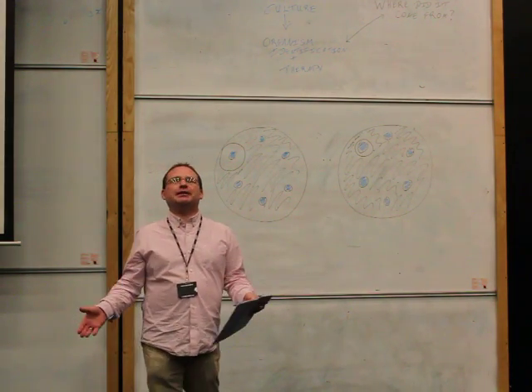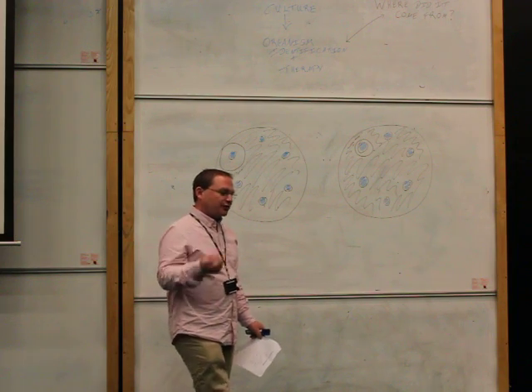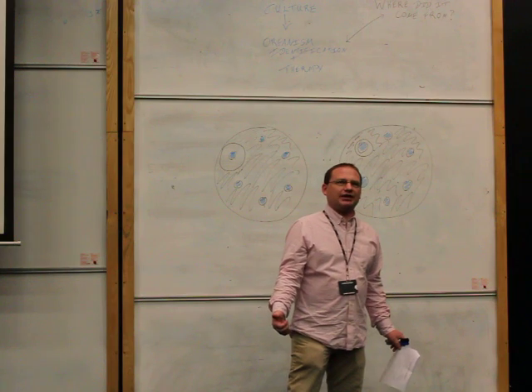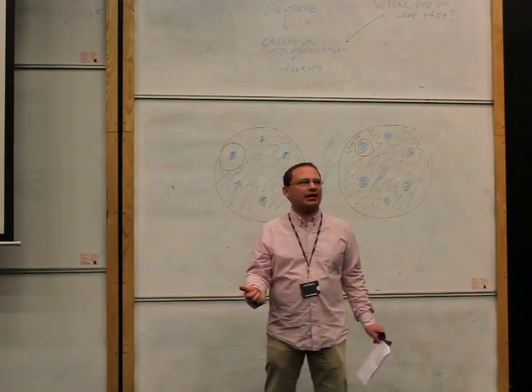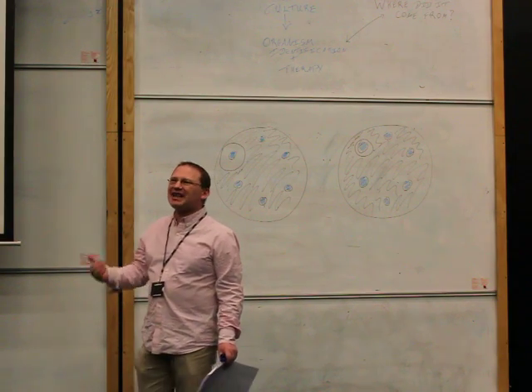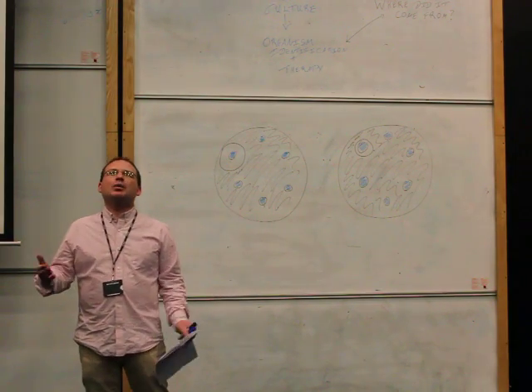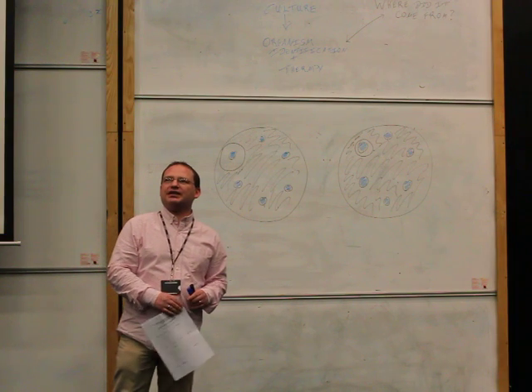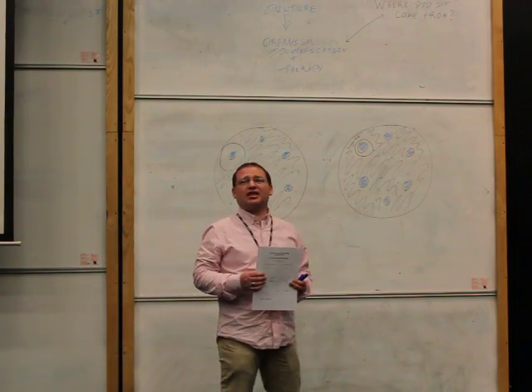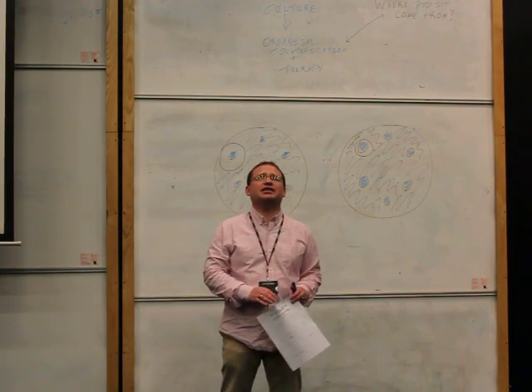You do a Gram stain. You would want to look at the morphology of that organism. Is it a Gram-positive organism, as in it stains purple with a Gram stain? Is it a Gram-negative organism, as in it stains pink with a Gram stain? What shape is it? Is it a coccus? Is it a rod? Is it cocci in chains? Clusters? Are they rods in chains? Are they in clusters?